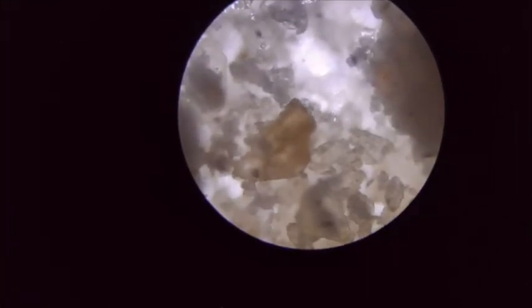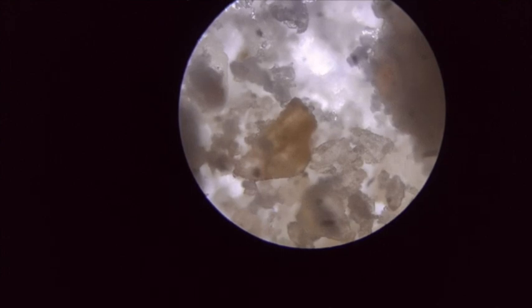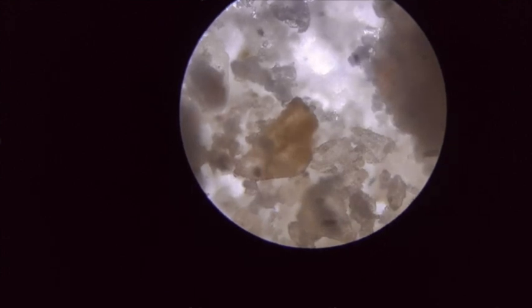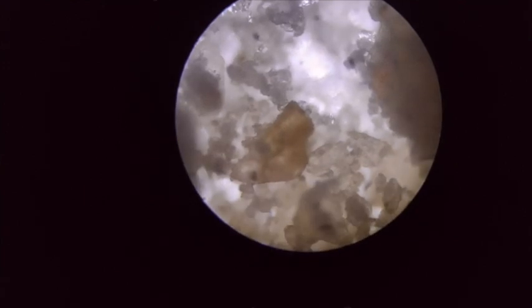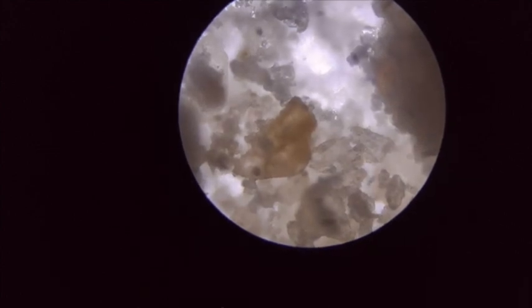So guys, I can see the crystals of black salt now. They're much smaller than the white salt and it's like flat. It's very different. I wonder why it's called salt still. It looks like dead flies in autumn leaves. I can see this particular one is especially more flat. Why is it flat? Okay, this was definitely very weird.